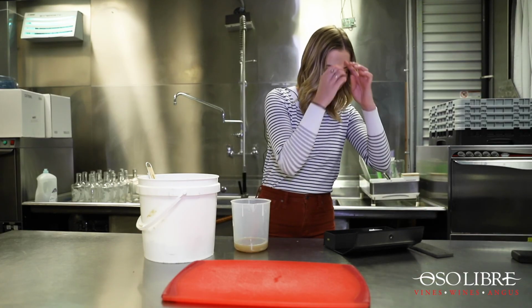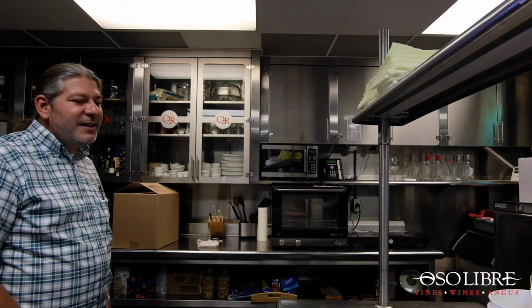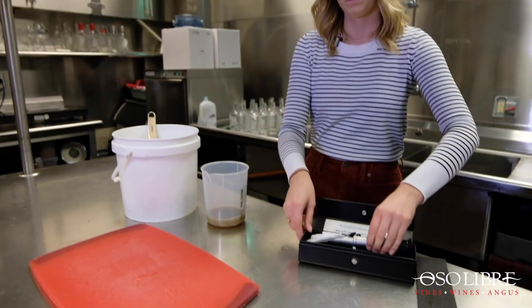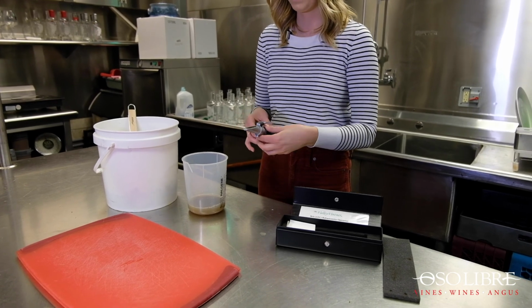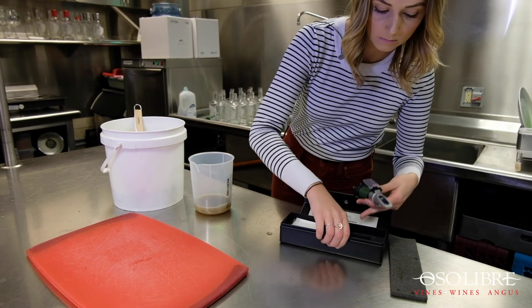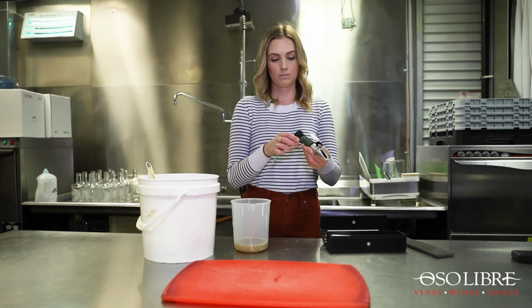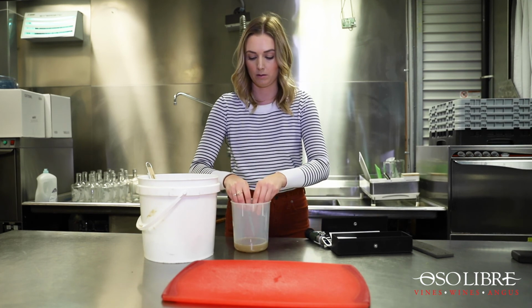And now you've got the refractometer. Go ahead and pull that up. It looks like a little telescope. You can leave the tissue in the box. And then there is a little dropper in there, in the box. Pick up the dropper. And go into the juice and pick up a little bit of grape juice.